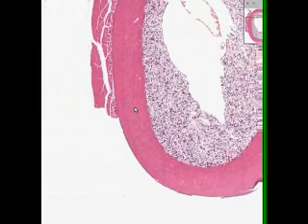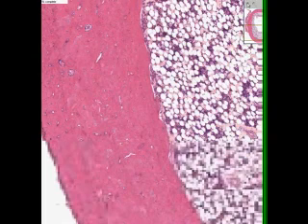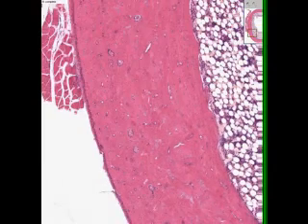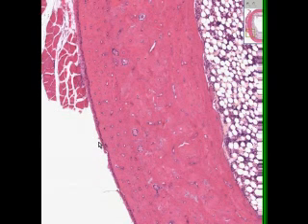Let's take some of this dense cortical bone and take a look at it and see what we could identify here. Well, the first thing you could see is that there is a pretty good little peel of fibrous connective tissue, dense fibrous connective tissue over the outer edge of the cortical bone, and that's periosteum. Even though periosteum does a lot of magical things, basically it looks pretty boring. It looks like just a little piece of fibrous connective tissue.